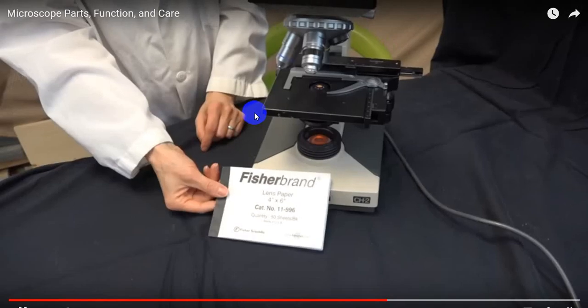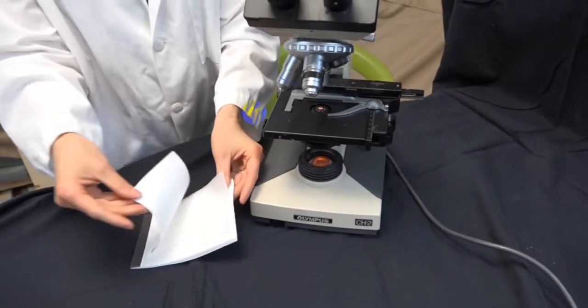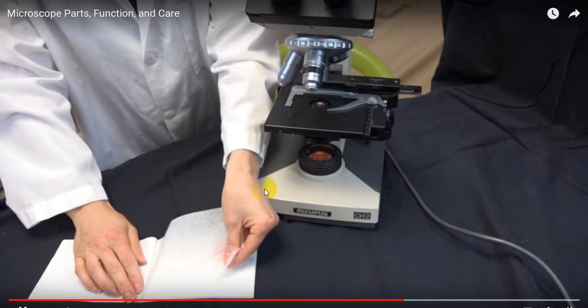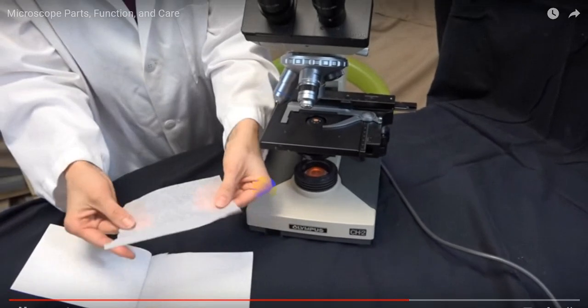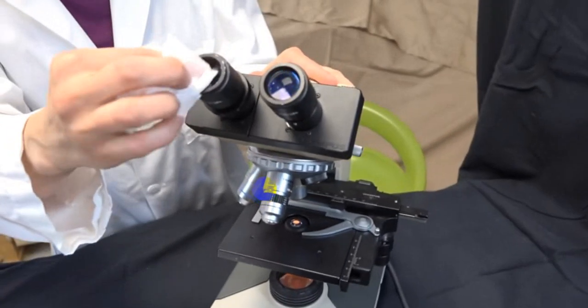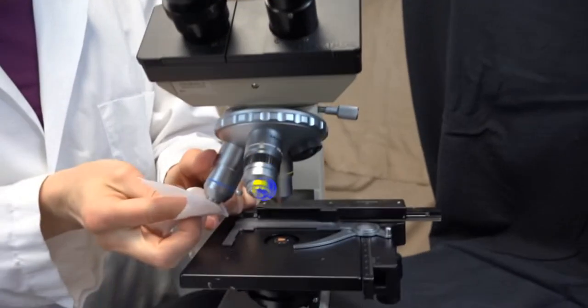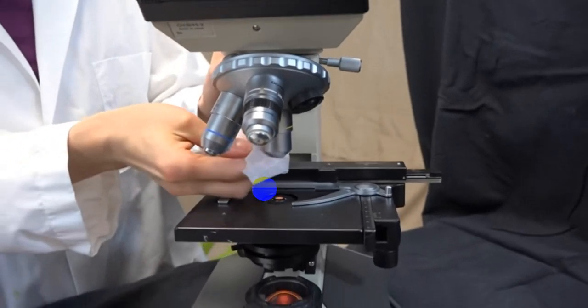How do you clean the microscope? When you're finished using the microscope, make sure that you clean it. We'll use lens paper to clean all the lenses. Remove a sheet of lens paper, and you can wipe off the oculars, or the eyepiece. You can also wipe off the objectives. The objectives are 4 times, 10 times, 40 times and 100 times.